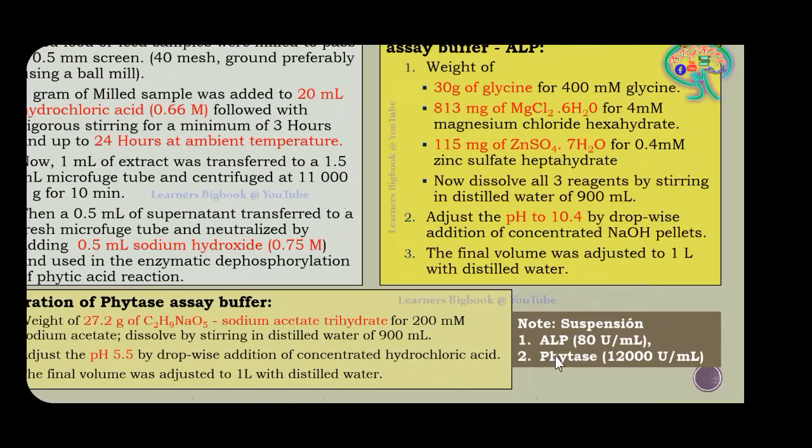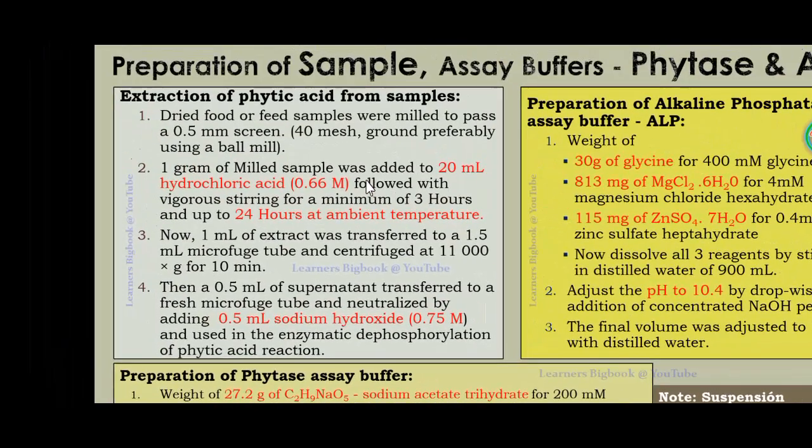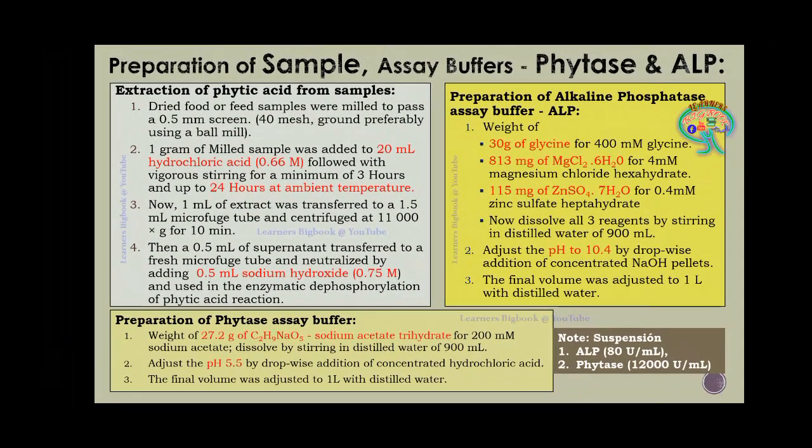Now as I said, these are the enzymes. These have to be purchased from a distributor of chemicals. So here you can get them from any good company.